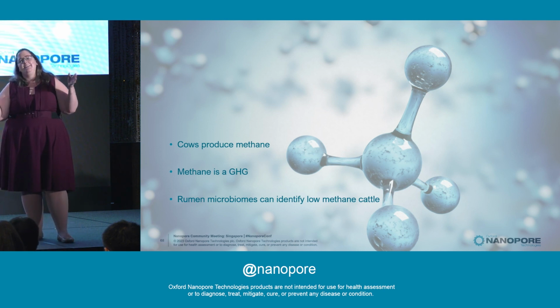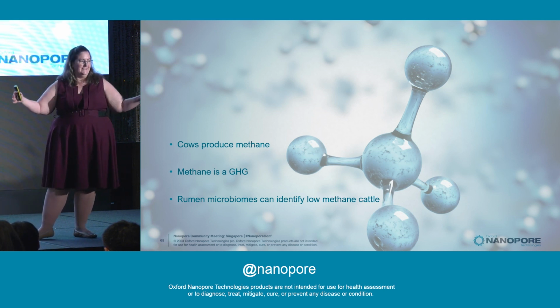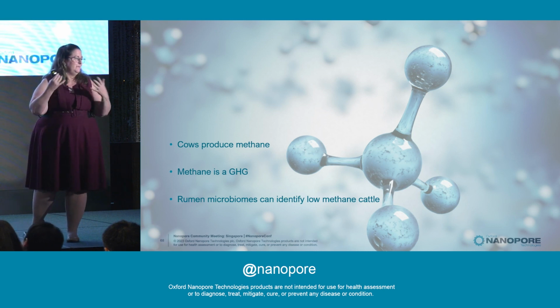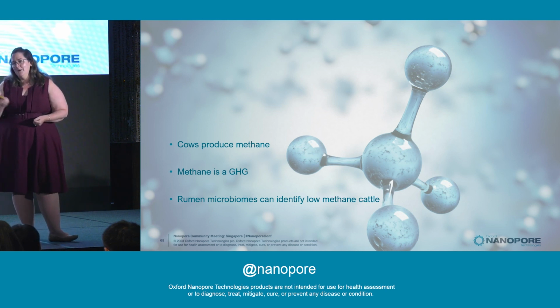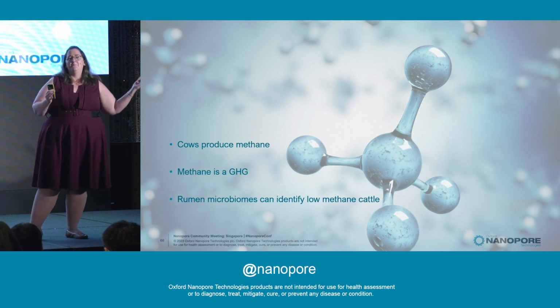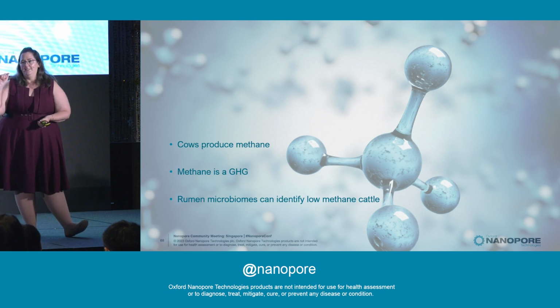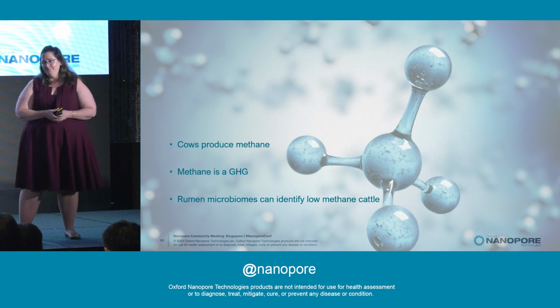But the one thing we have going for us is there is massive variation from animal to animal in how much methane they actually produce. And about 10 years ago, I showed that you can use the rumen microbiome, that population of microbes in the rumen, to identify high and low methane emitting cattle. But when I did that back then, we were using Illumina data, so we were using short read data. And the problem with short read data is that when you are trying to look at a microbiome, such a tiny percentage of that data is actually classifiable. You can only classify around 6% of the data if you use short read sequencing.